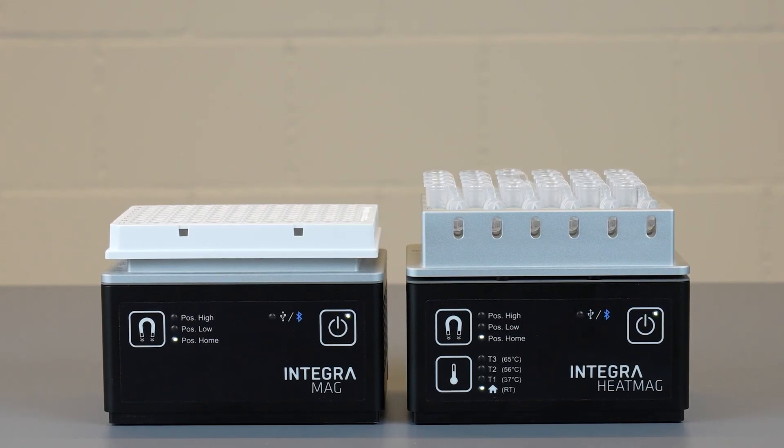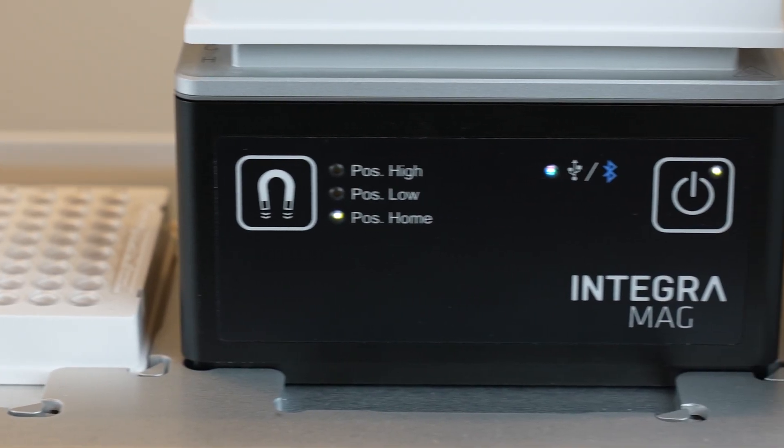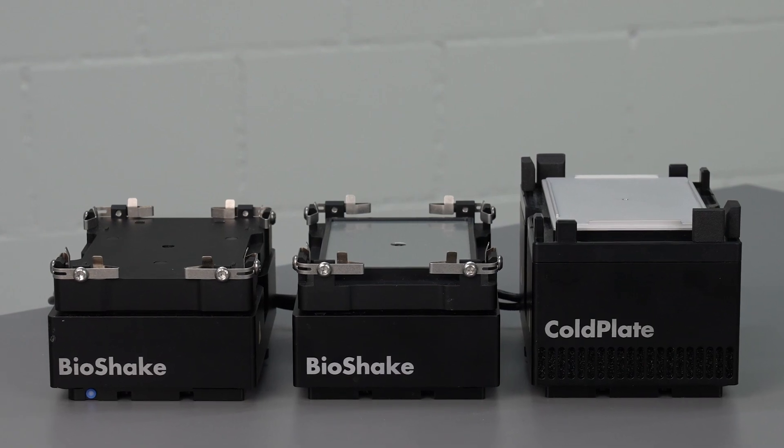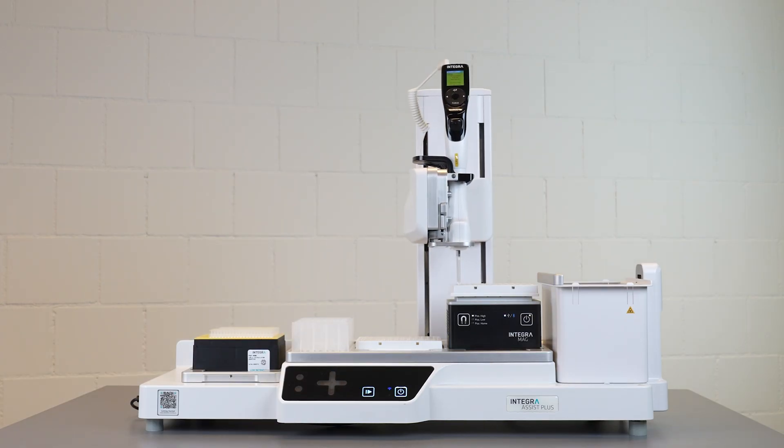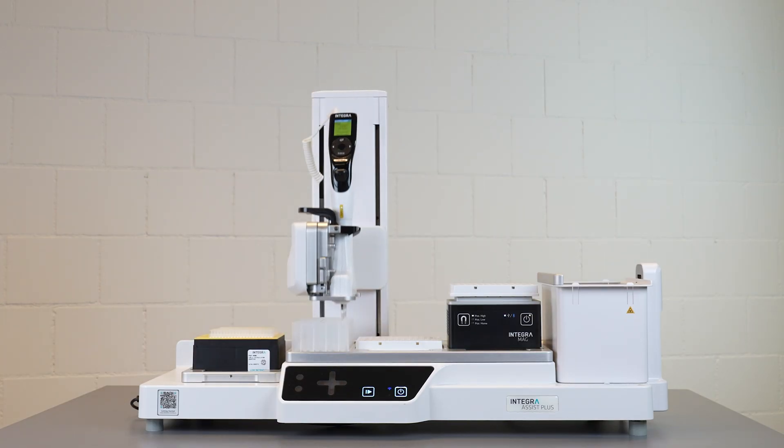Our Mag and Heat Mag magnetic modules, combined with our advanced heating, cooling, and shaking modules, are designed to simplify your workflows and amplify your outcomes. For more information on how our modules can transform your lab experience, visit our website.